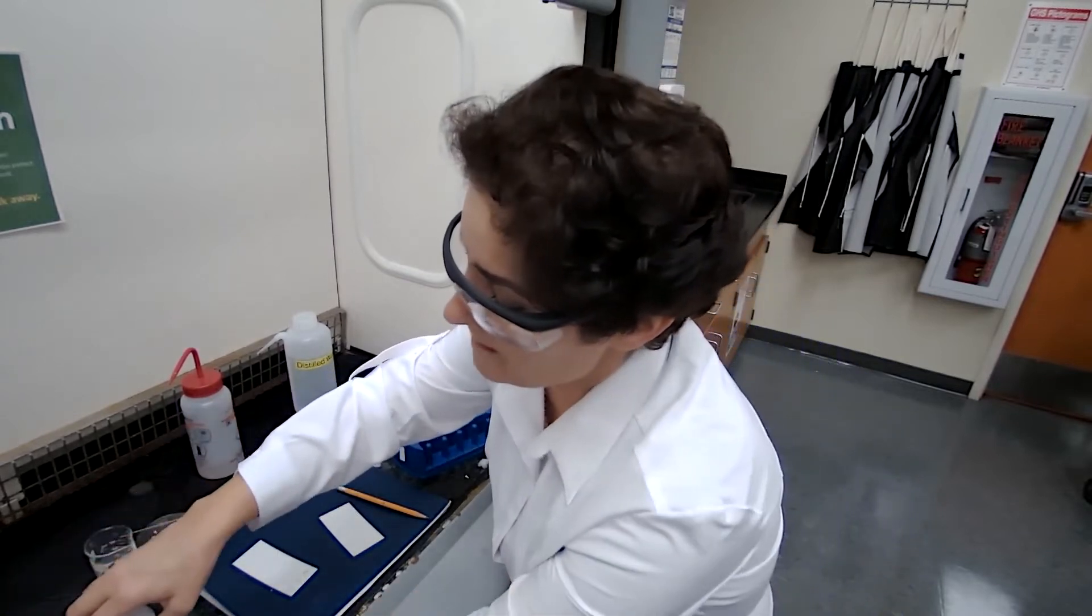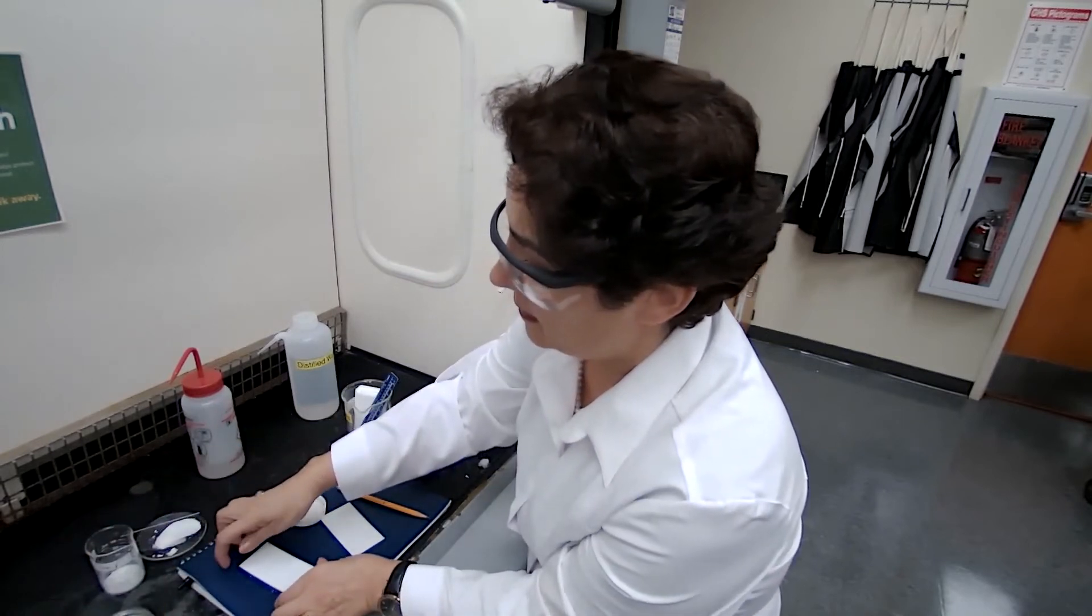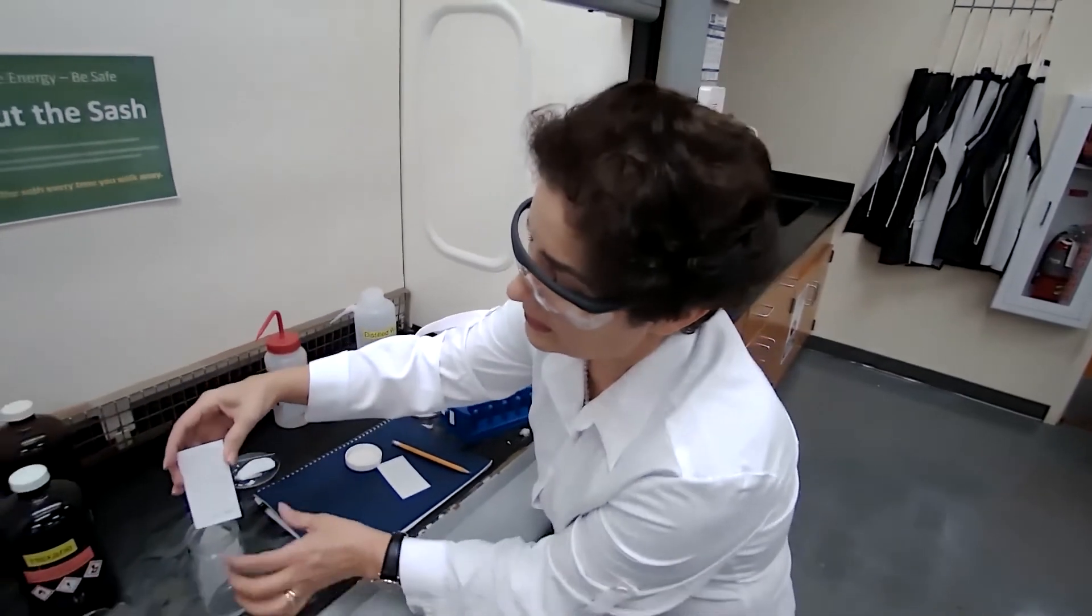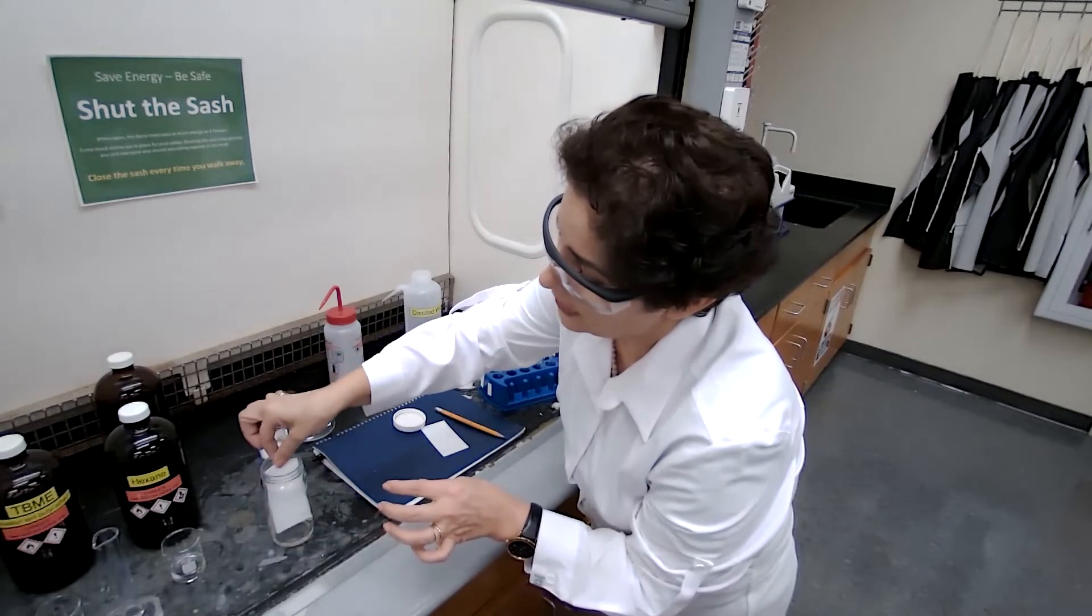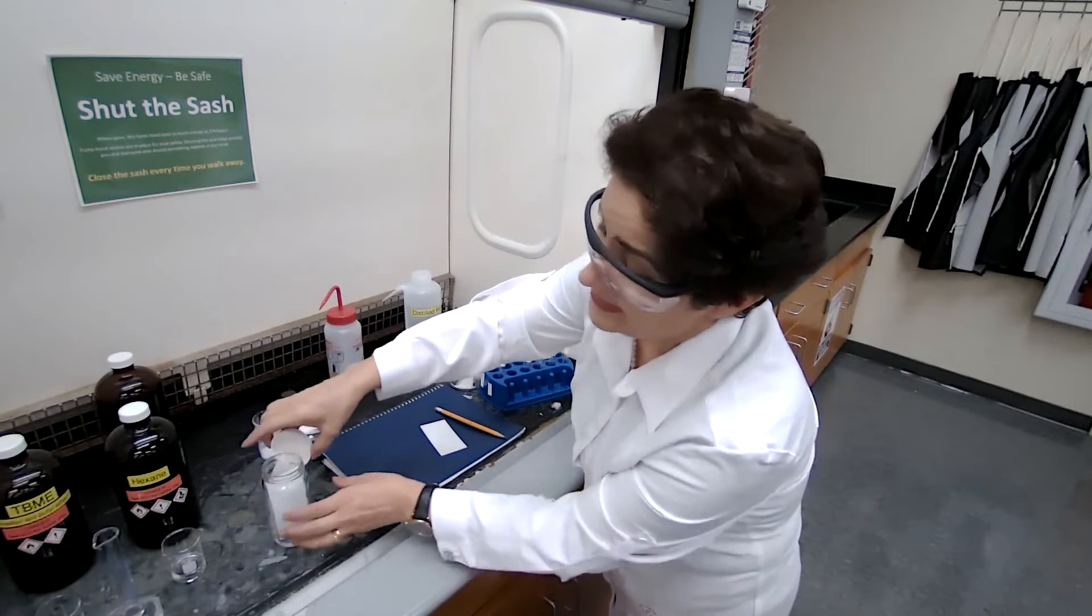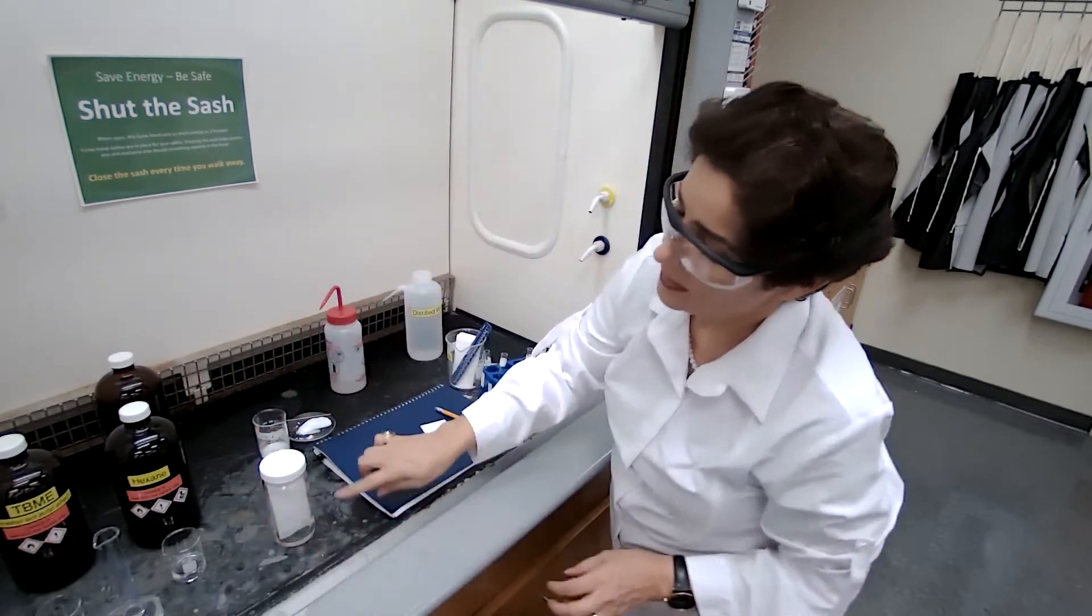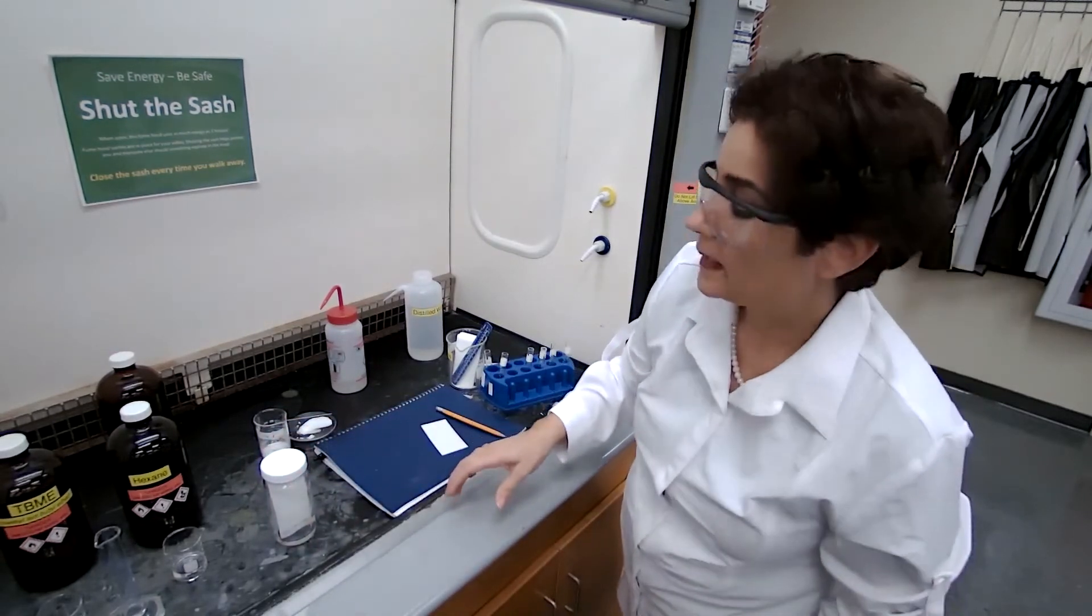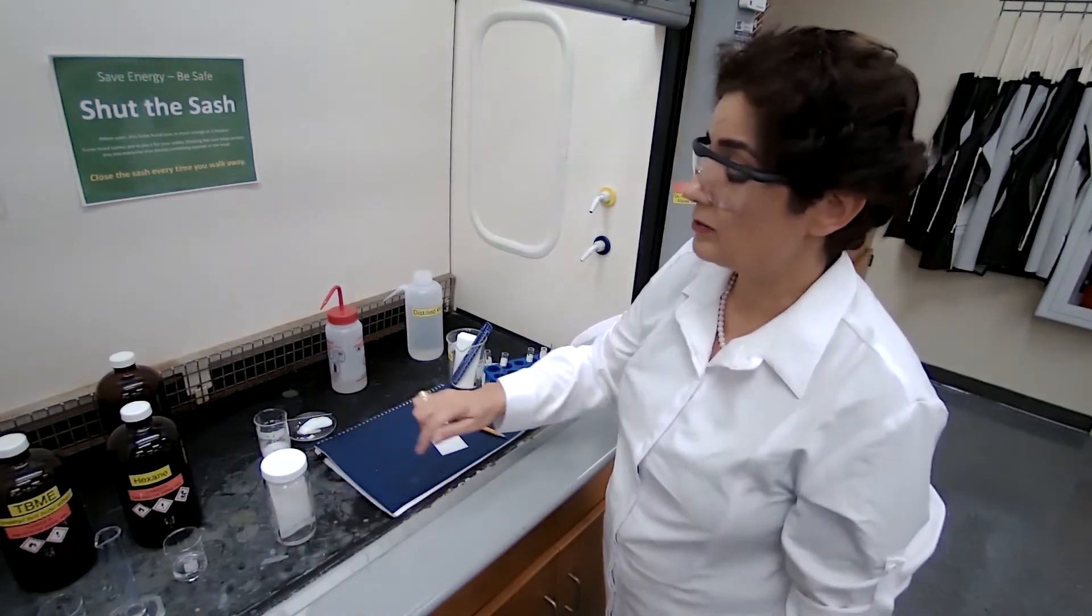And now we are going to place in developing chamber, touching the side only, carefully placing the developing chamber and wait for it to reach the top of the TLC plate about half an inch from the top of the TLC plate. So we are waiting for that to happen. Again, the video will be paused. I'll come back when it's almost to the top.